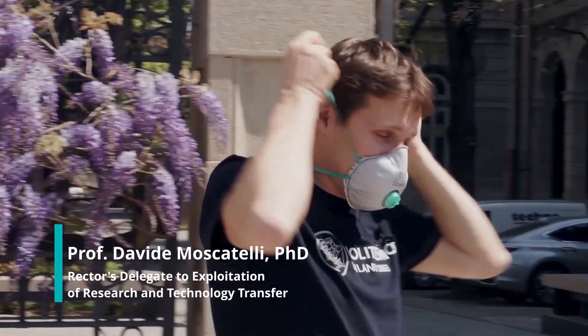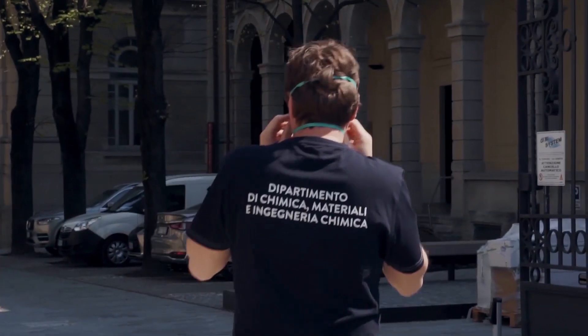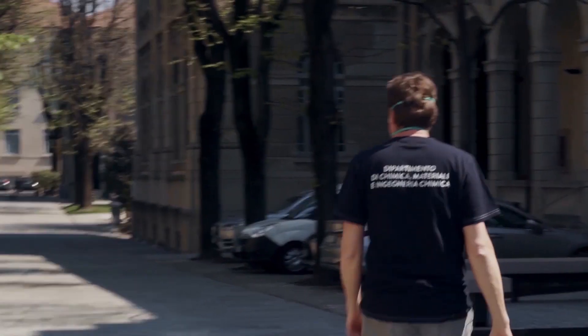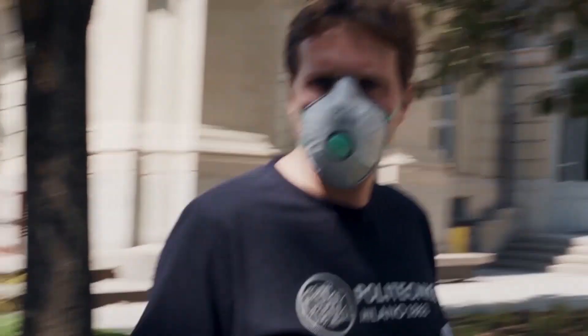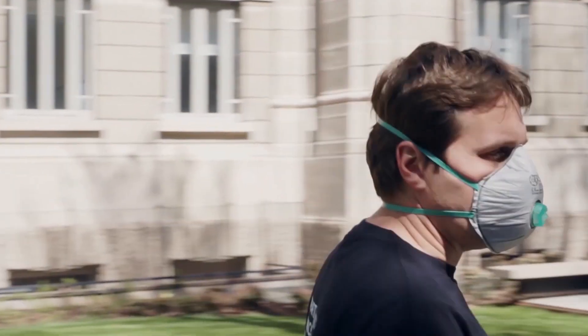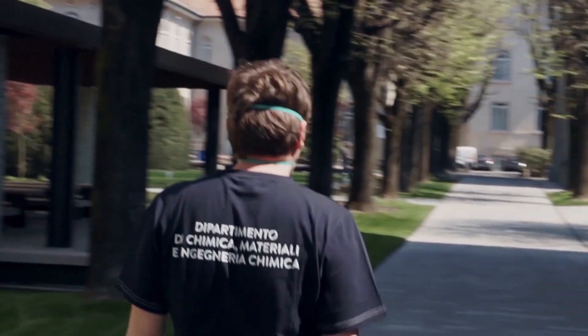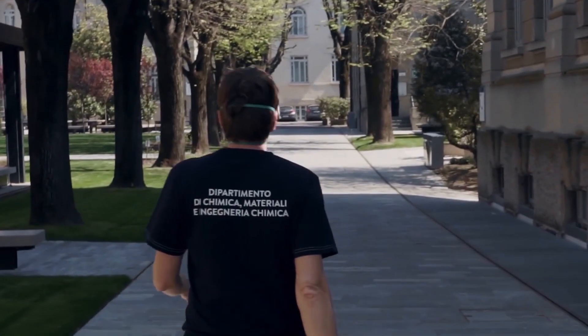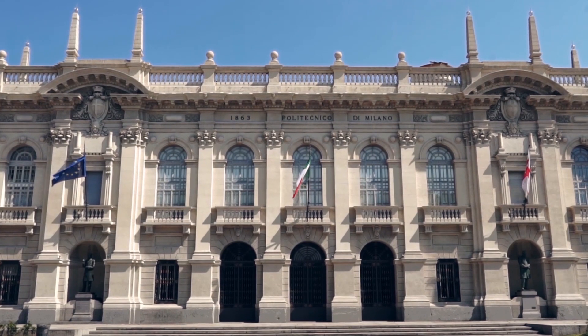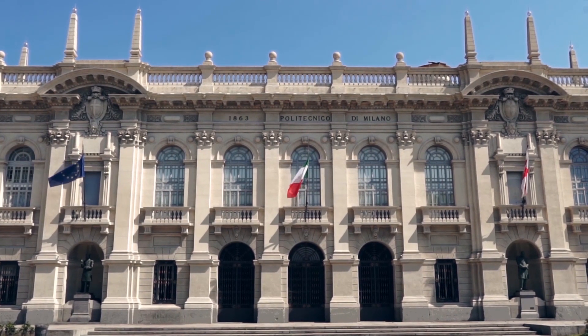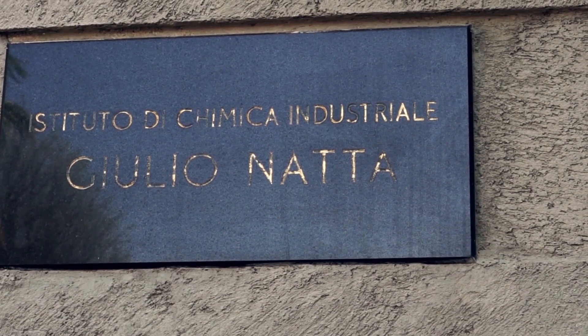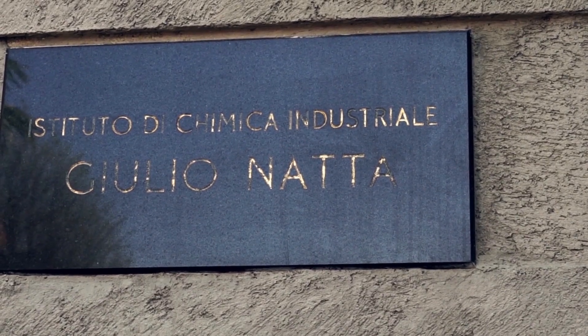Welcome to the Politecnico di Milano. In the short video following, we'll show how to install a plant for the production of a hygienizing solution following the directions of the World Health Organization. The plant has been installed at the Politecnico di Milano in the Department of Chemistry, Materials and Chemical Engineering Giulio Natta to face the COVID-19 emergency.